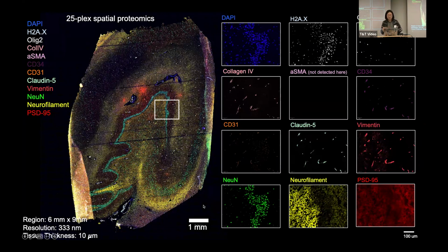And we are the very first team in the world doing the human hippocampus, because this technology is so new and the antibodies are not so well validated. Previously, when the group was inventing this technology, they were studying immune and gut. So there are only about 40 antibodies developed for CD markers and immune markers. But for the brain, we have to validate every antibody by itself, and then conjugate the barcodes and then test the panel together.